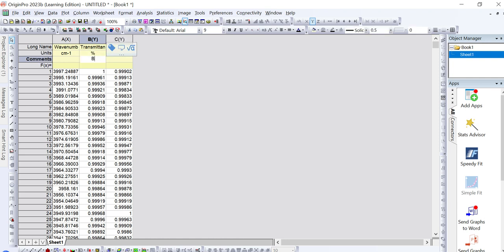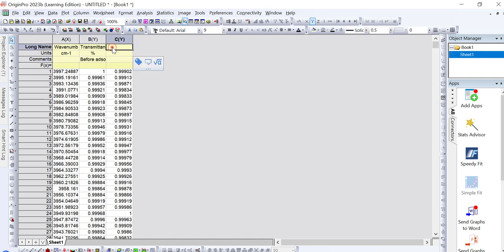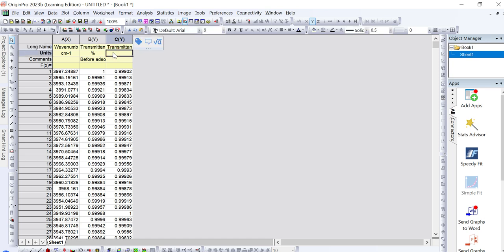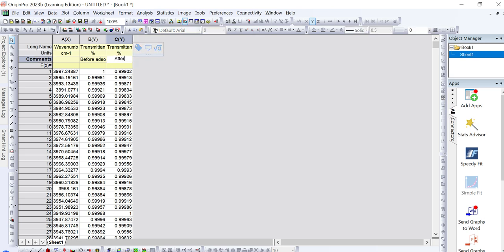In the comments section for the second column, you can write 'FTIR data before adsorption,' or 'before treatment,' or 'before photocatalysis.' Similarly, for the third column, it is also transmittance data with the unit percentage, and in the comment section write 'after adsorption' to indicate it is FTIR data after the treatment process.